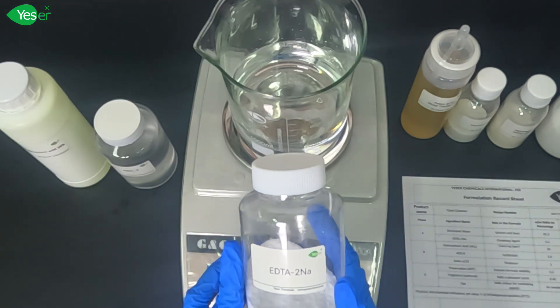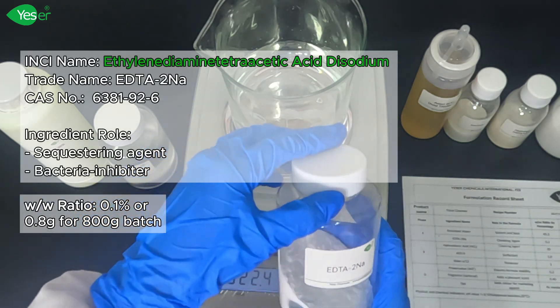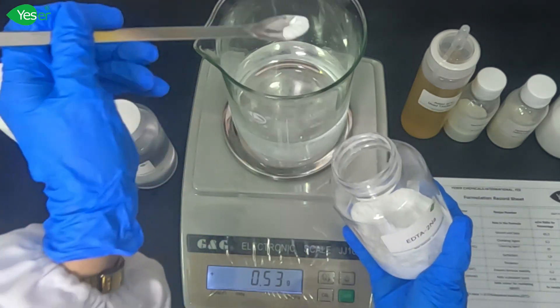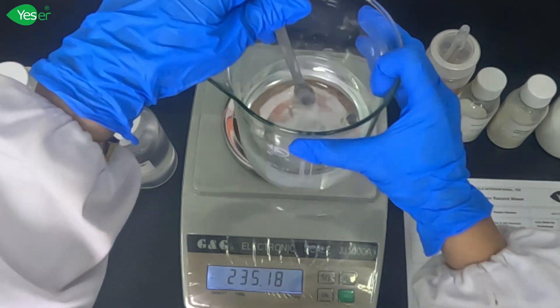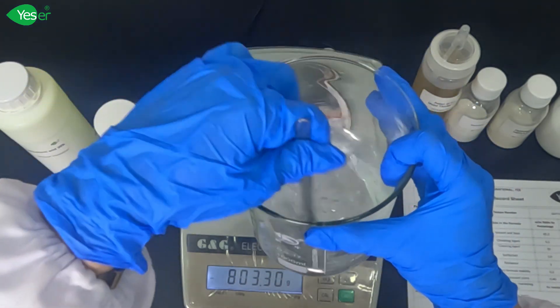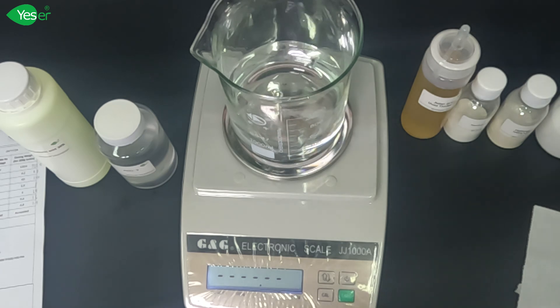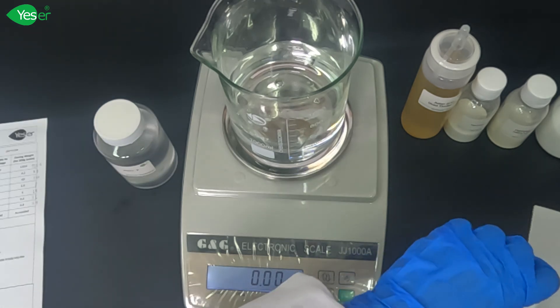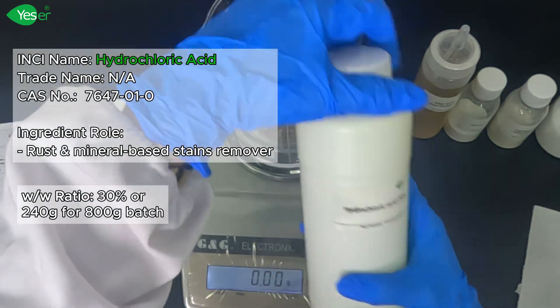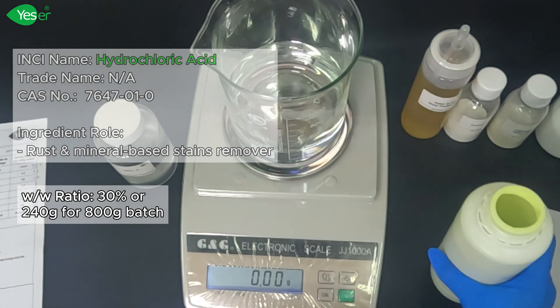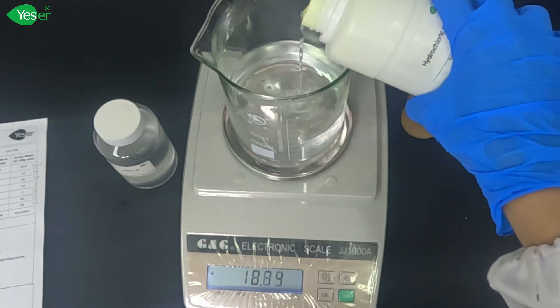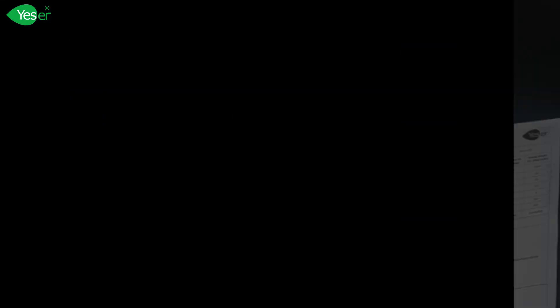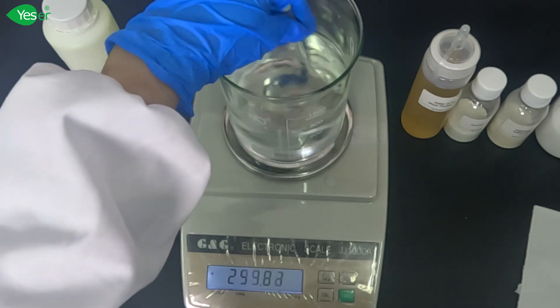Next, let's add our EDTA disodium, our chelating agent. Weigh about 0.8 grams or 0.1% for the formula. After our chelating agent, we will add our hydrochloric acid or HCl. Carefully weigh about 240 grams of HCl in our formula. Mix this carefully until fully incorporated.